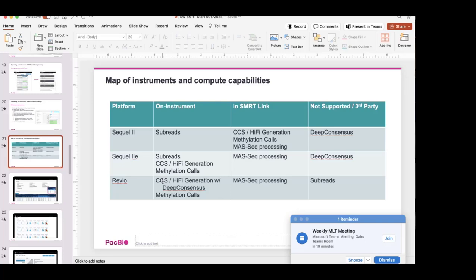By sequencing it in a circle n number of times, after a certain number of passes, if these are all truly random errors and not systemic errors generated by the platform, over a bunch of different passes over the same sequence, it should just resolve those errors on its own. You should only see it miscall a base once, but you have like 30 other calls over that same base that say it's a different base, then the consensus should be the corrected base.